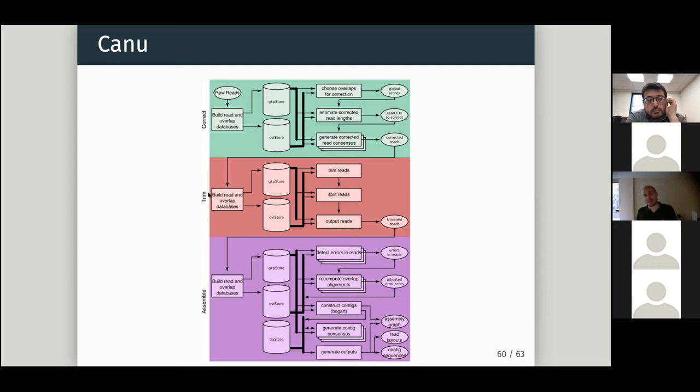Well, there is a trimming step where you basically remove some of the things that are at the edges of the reads, so you end up with trimmed reads, and then here is where you build the assembly graph. And then your final contig sequences. Again, overlap, layout, and consensus. Overlap, find the overlap between the reads, and then create these read layouts, okay, where they are all piled on top of each other, and then walk through the read layout to reconstruct the final sequence. Of course, much easier to say than to do.